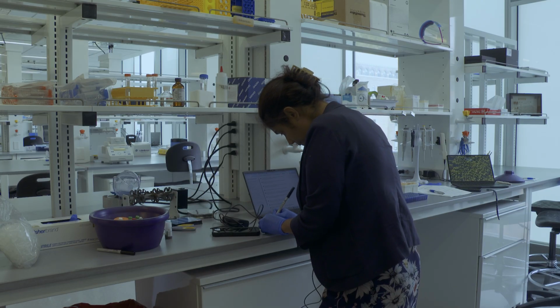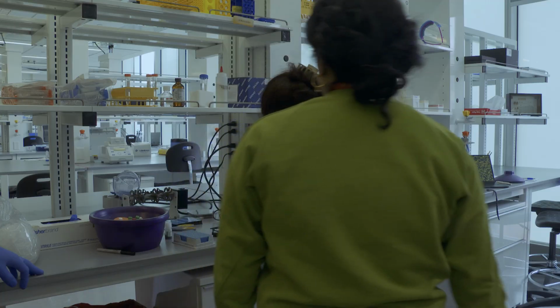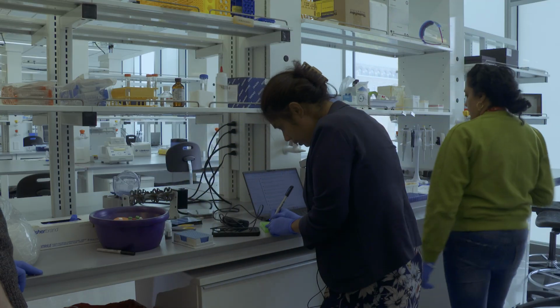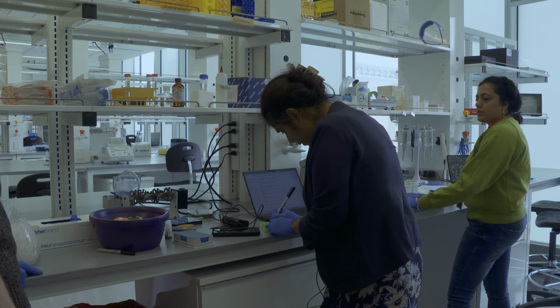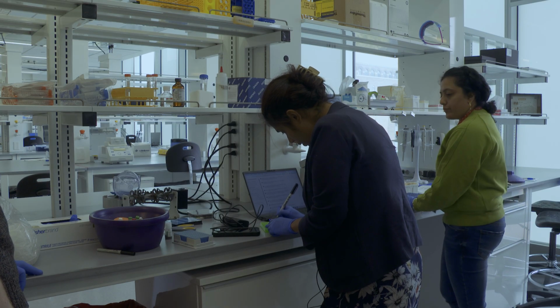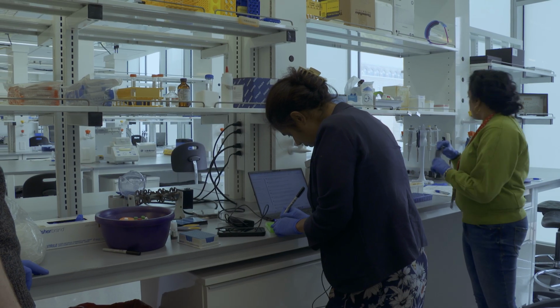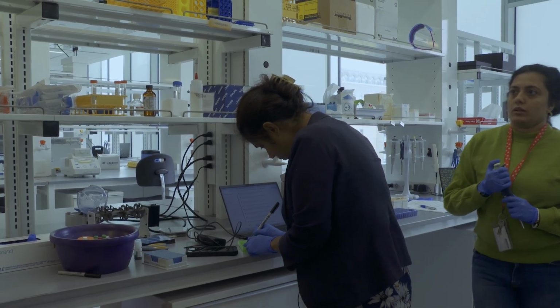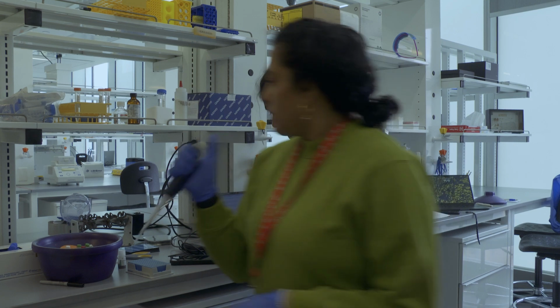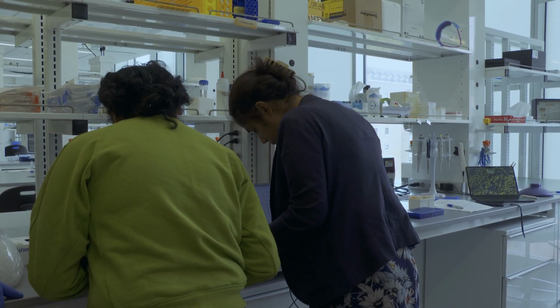Oh, sweet. But this freezes the enzyme. I don't know. When I do 10x, it freezes. Oh, because it's at that temperature. Sorry. Is another ice bucket just better? It's okay. Don't worry. If your sample is fine, then it's fine. That one retains some of these enzymes, even if you don't do the second thing, it still retains them. Which one was it?